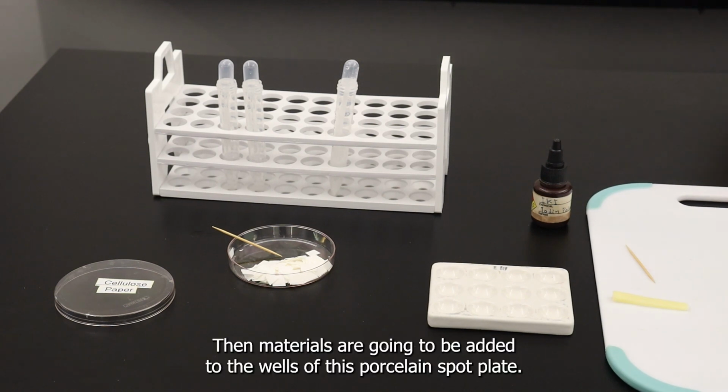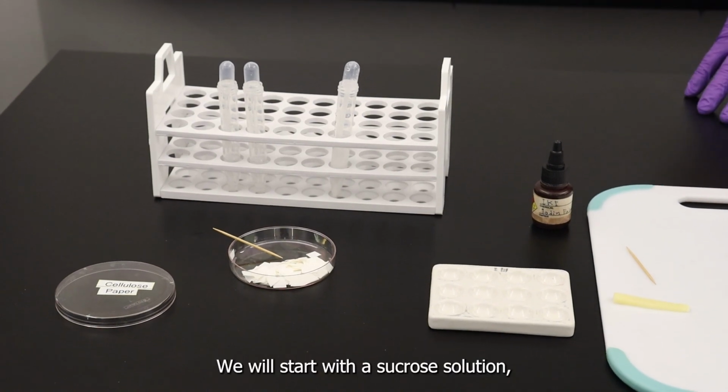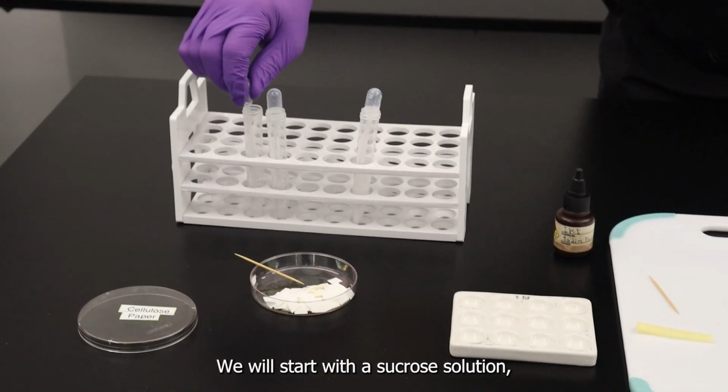The materials are going to be added to the wells of this porcelain spot plate. We will start with a sucrose solution.